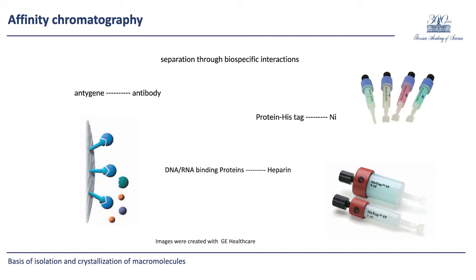It's a very convenient type of chromatography. The main feature that determines the high efficiency of affinity chromatography is that the separation is based not on the difference in the physicochemical characteristics of the molecule, charge, shape, and size, but on the specific functional properties that distinguish this protein from many other biopolymers.